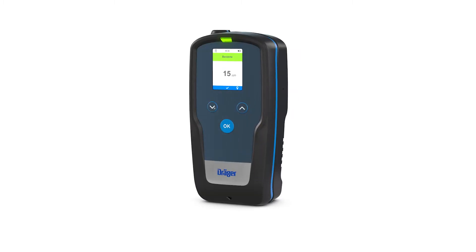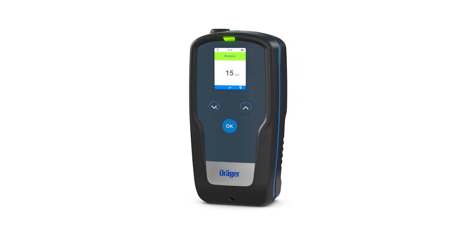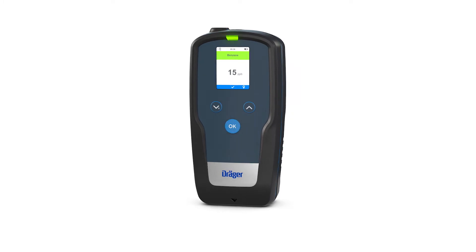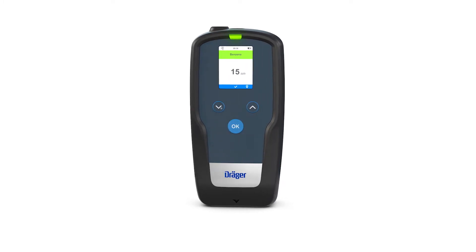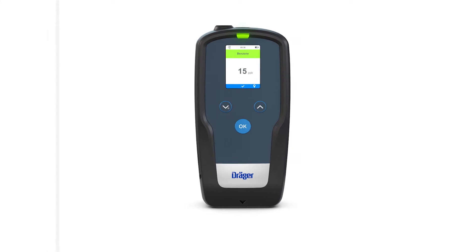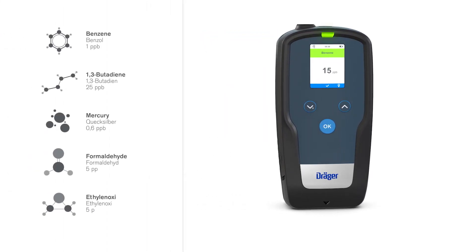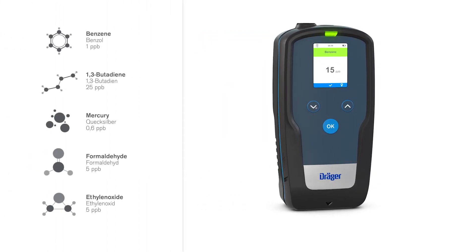The innovative Dräger X-act 7000 analysis system offers high precision gas detection in the low ppb range. This is particularly beneficial for testing for benzene and other carcinogenic toxins.